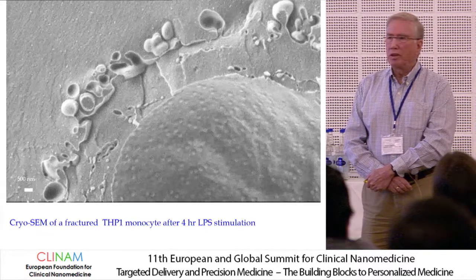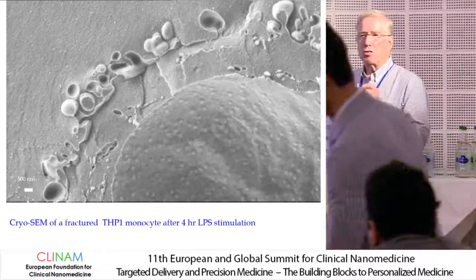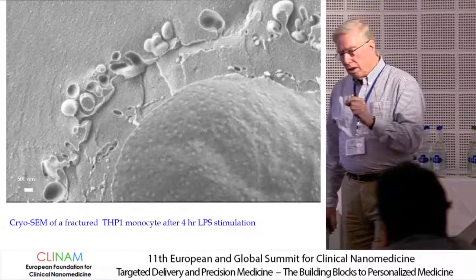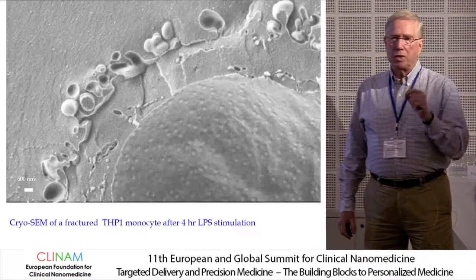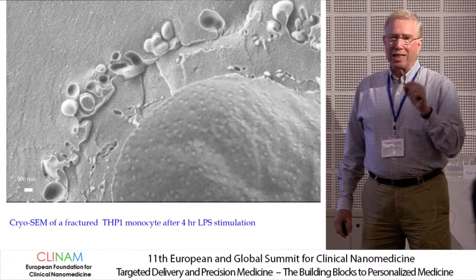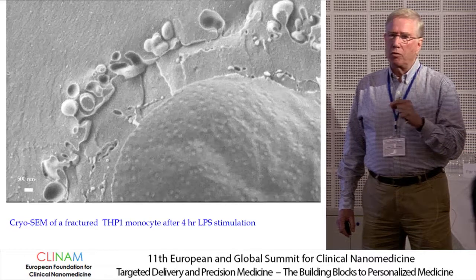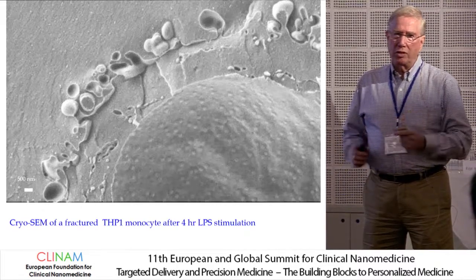Again, this is something that definitely can be done. If I may emphasize one point, in order to tell those small or not so small differences, you have to use a specimen preservation methodology that really keeps the original. When you use staining and drying, most of the differences will definitely be lost.